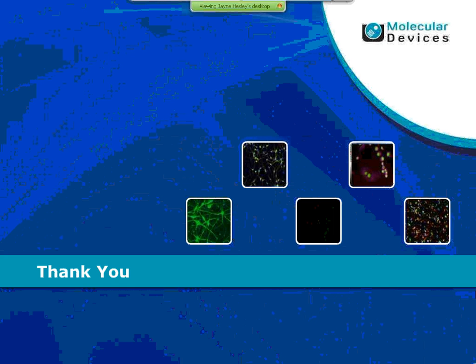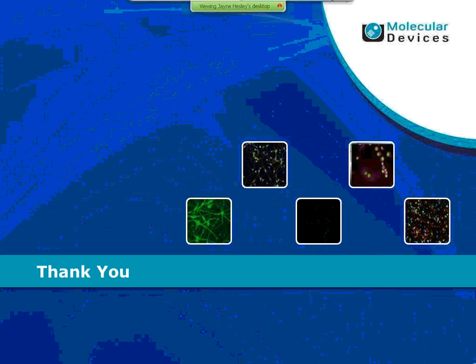If there are people out there, we've done these neuron assays in lower density well plates from 96 also. We've done them in 24 well plates as well. They don't necessarily have to be SBS standard plates. I did not mention the lower density plates. Thank you.